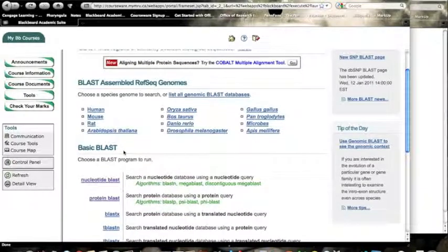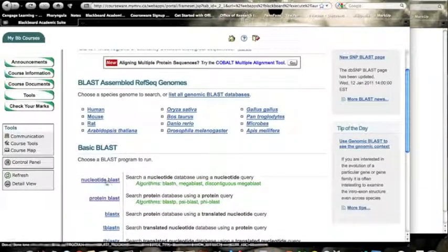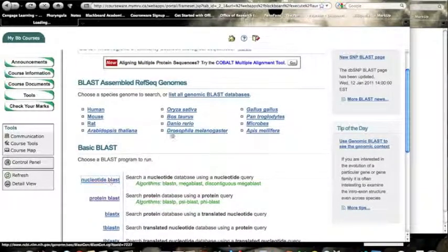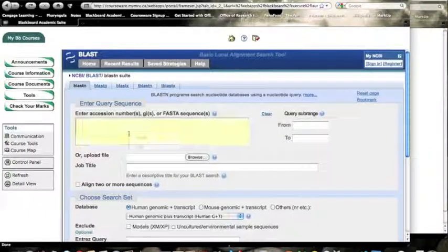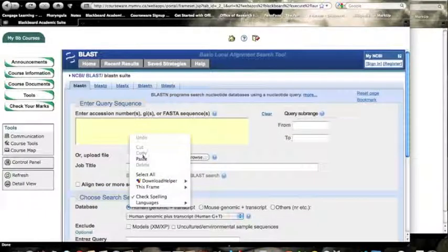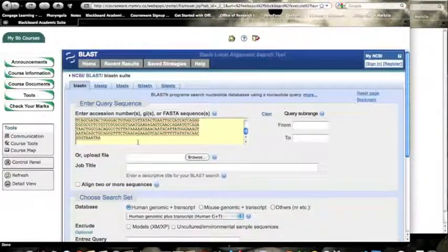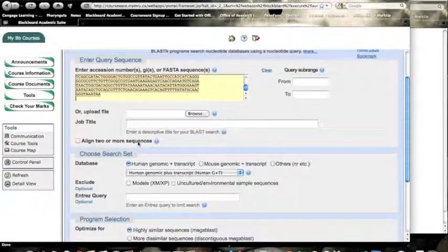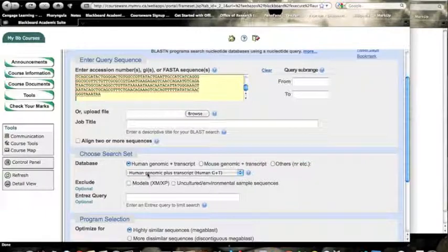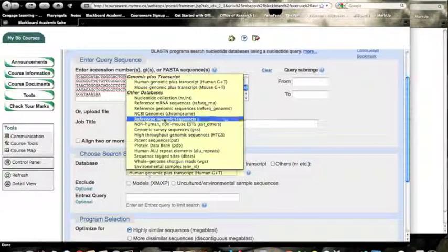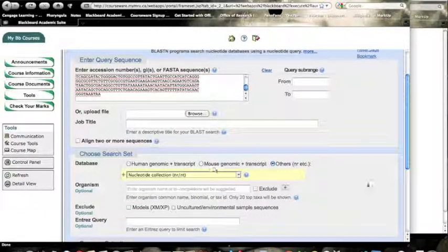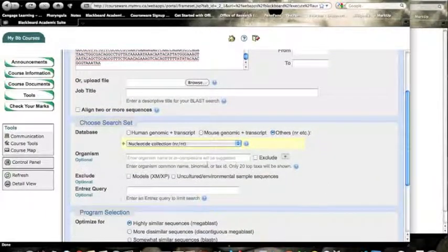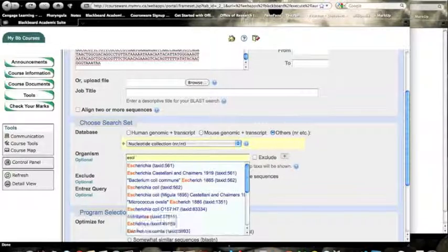And I want to do a nucleotide blast, because those are nucleotides that I have. I'll paste that in. And then when you go down to the database, we want to search it through the nucleotide collection. And specifically, we only want to look at Escherichia coli.